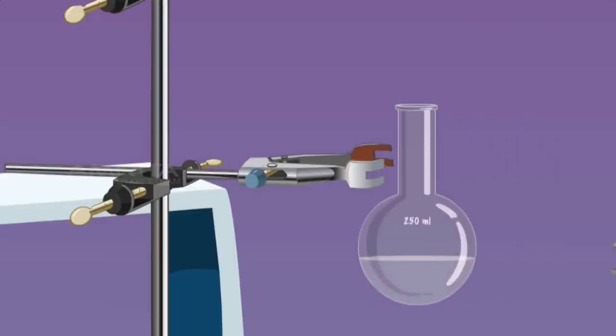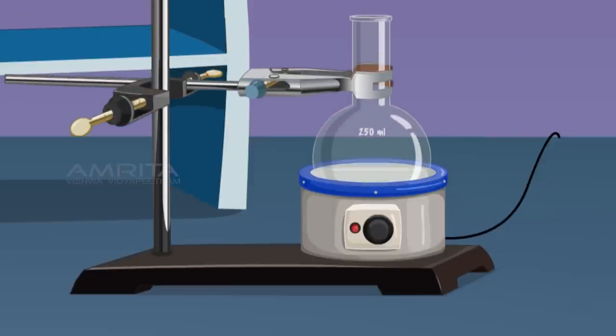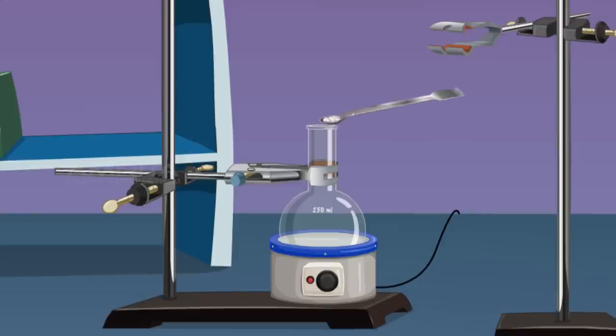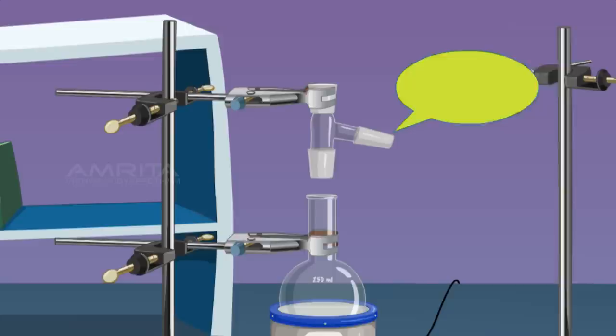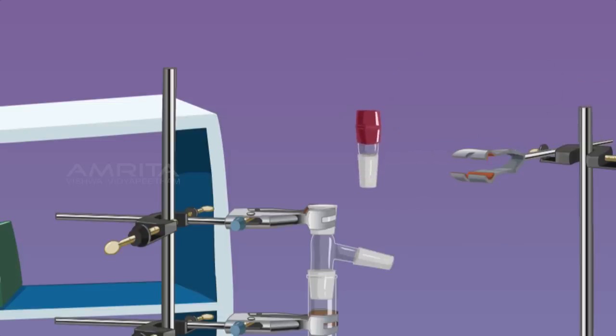Clamp the RB flask to a stand and place it in a heating mantle. Take some porcelain chips using a spatula and put them in the RB flask to avoid bumping while boiling. Connect a distilling head to the RB flask and a thermometer adapter to the distilling head.